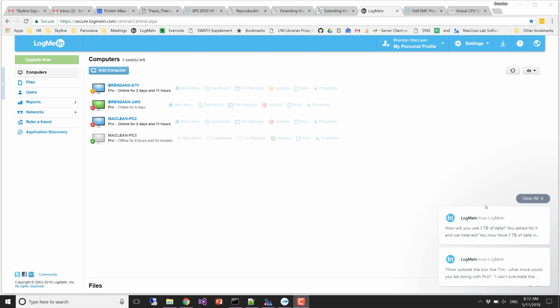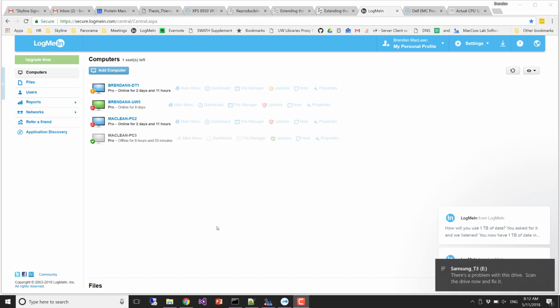The Bruderer data actually comes with a MaxQuant search, and that's what they built their library out of. Yeah, so they took a MaxQuant search. So let me show you that. So this is the SSD I've been talking about that has all the information on it. But it's probably like 300 gigabytes total.